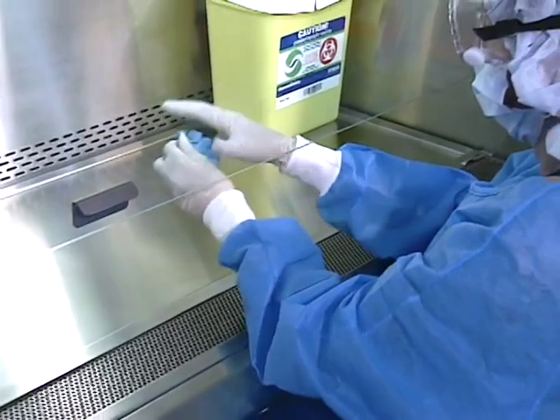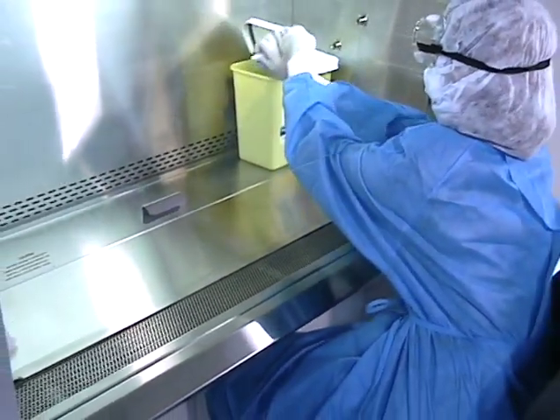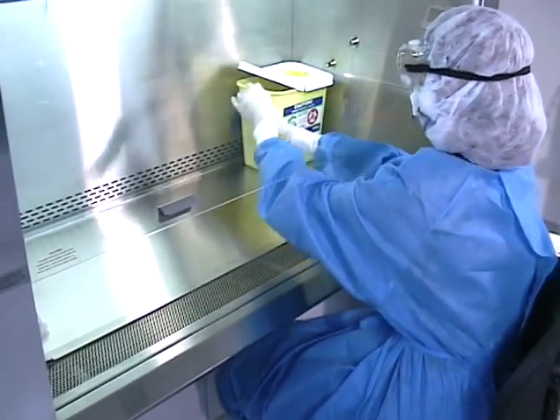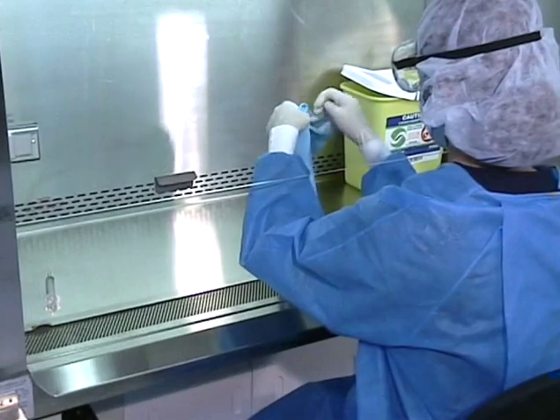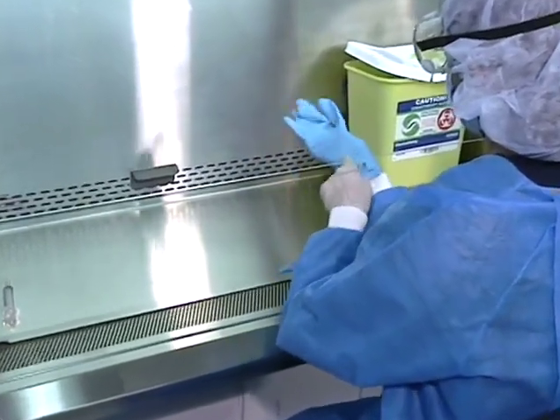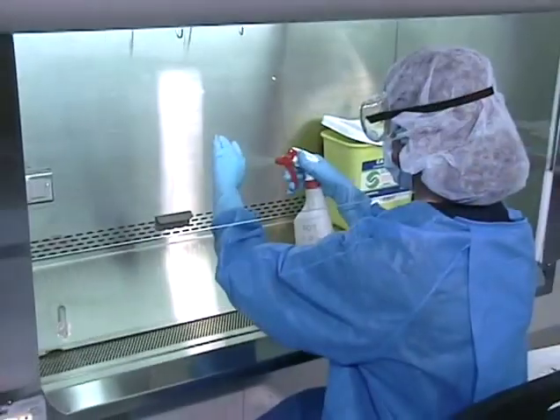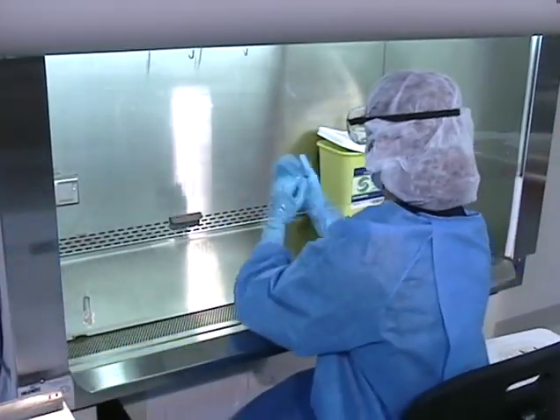Secure the outer gloves inside out, with all contamination inside the ball, and dispose of in the BSC internal waste container. Remove the hands from the BSC. Don a fresh pair of outer gloves prior to recommencing compounding and disinfect the gloves with 70% isopropyl alcohol. If compounding is completed, the gown should be removed next.